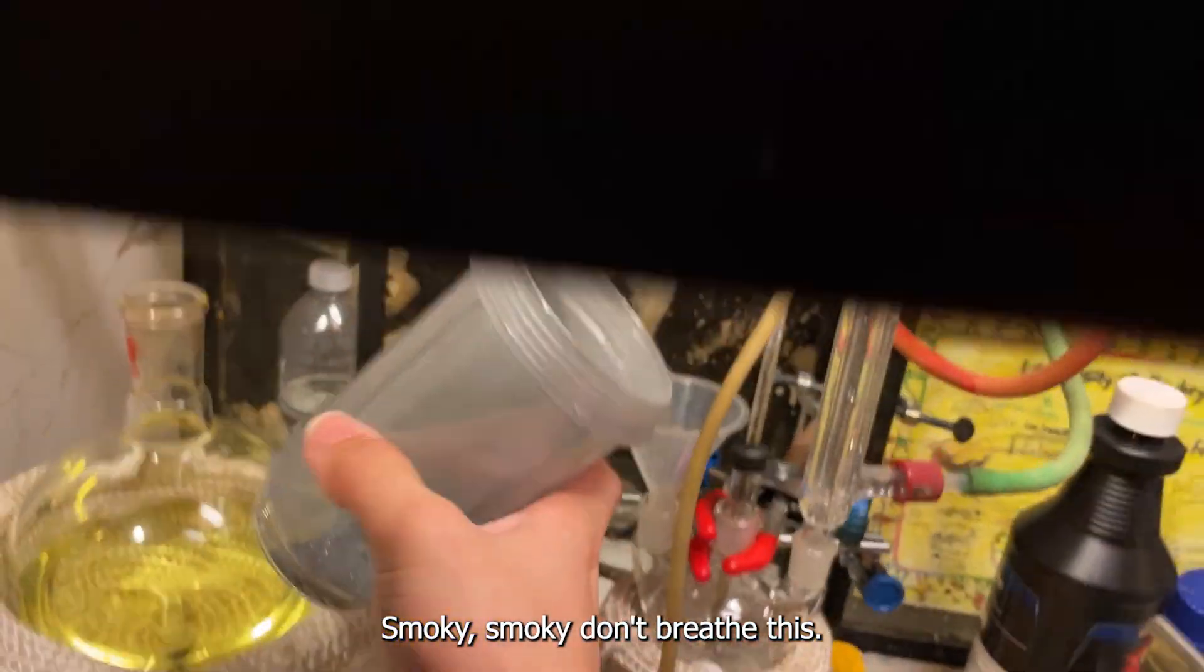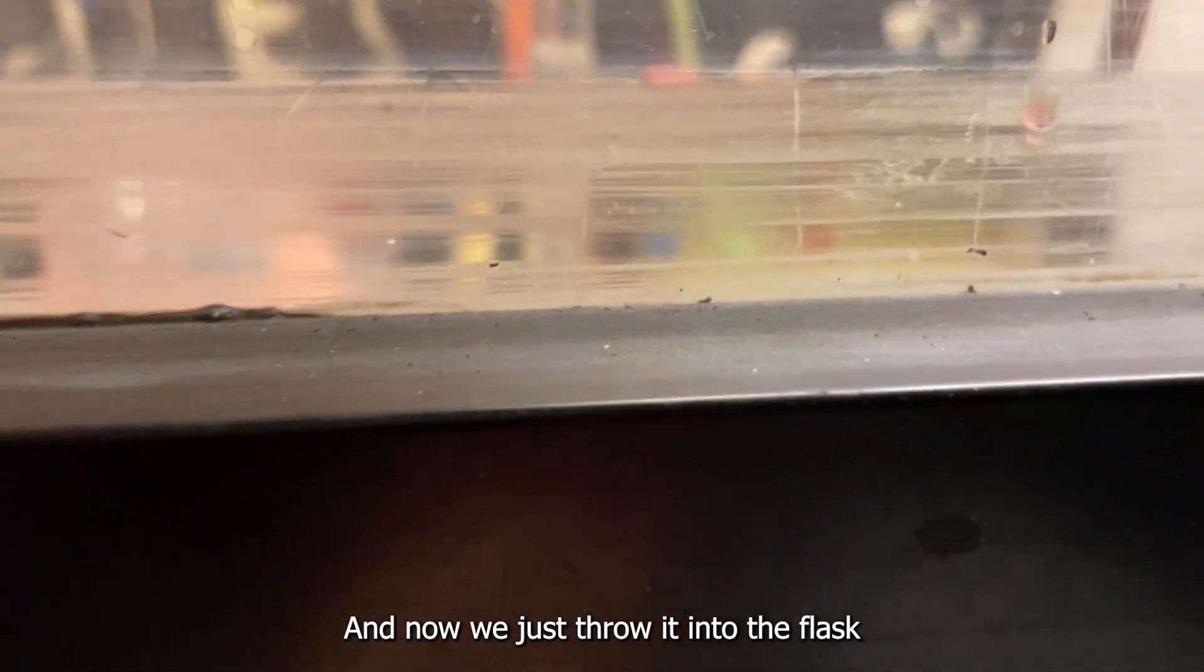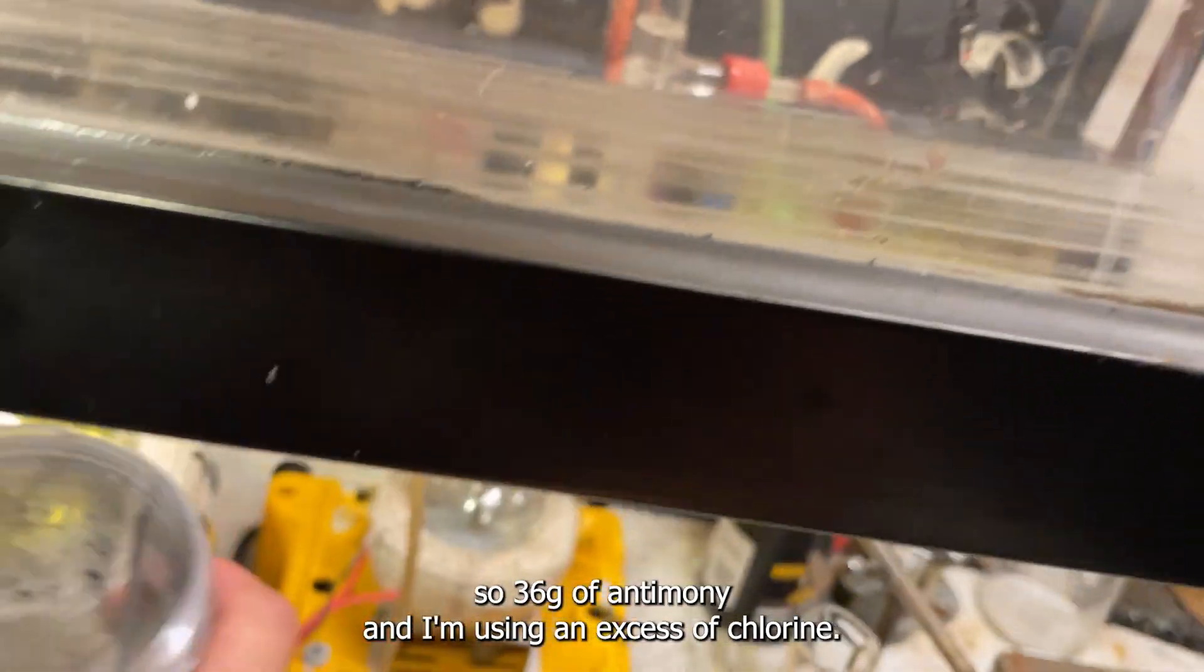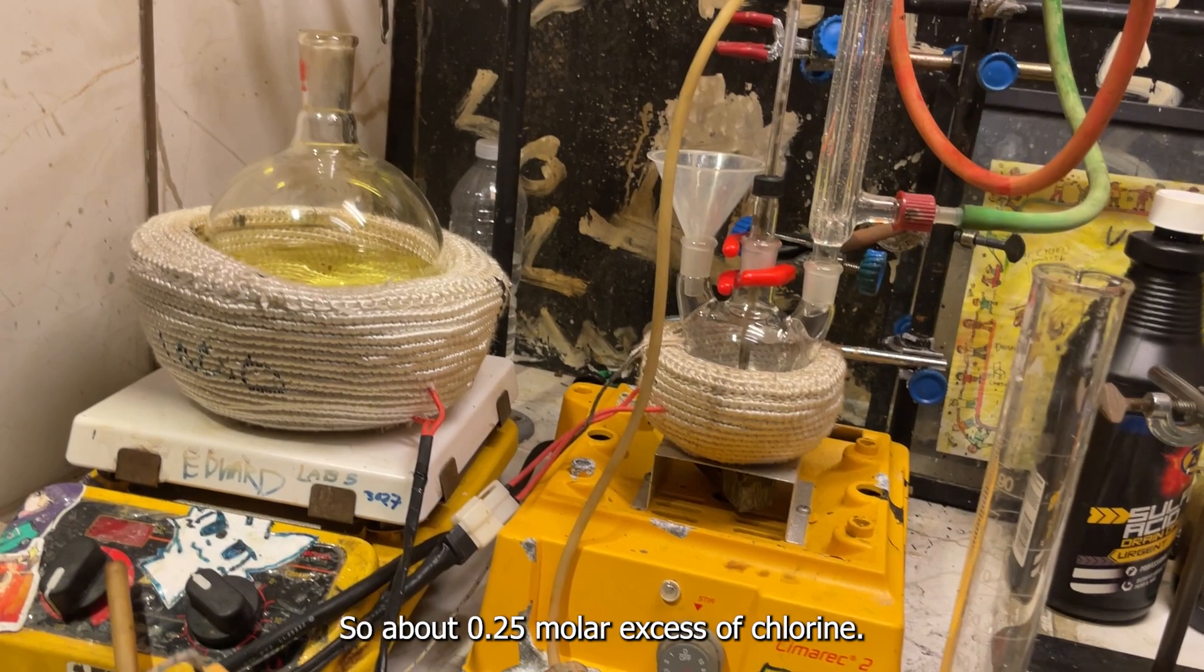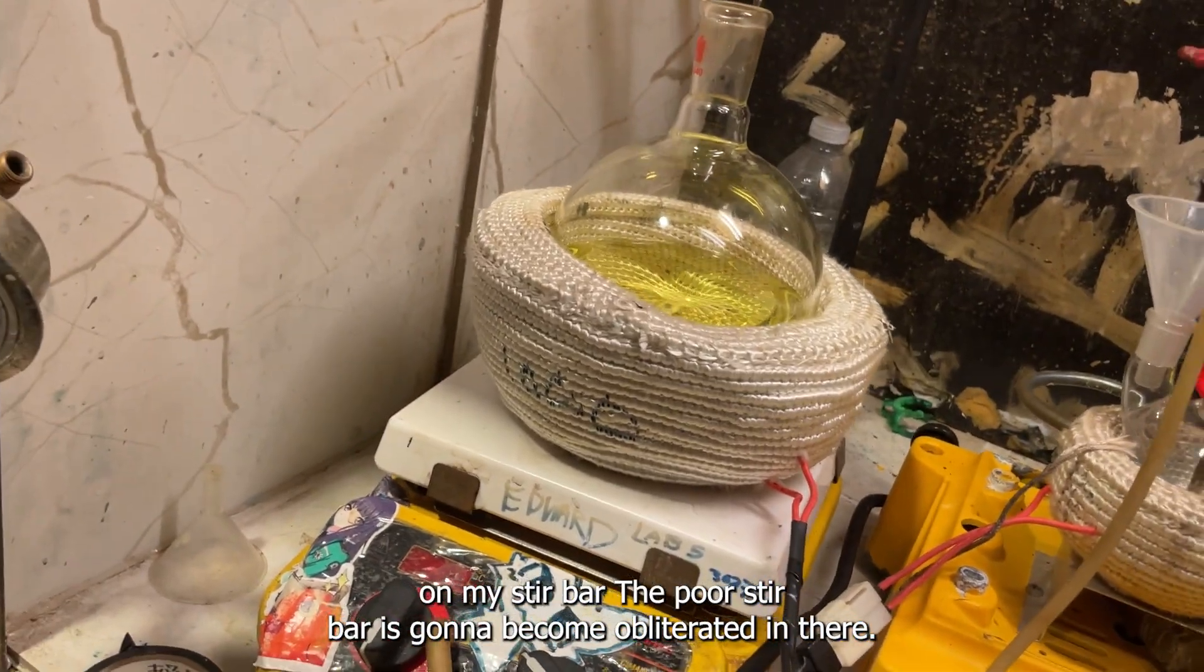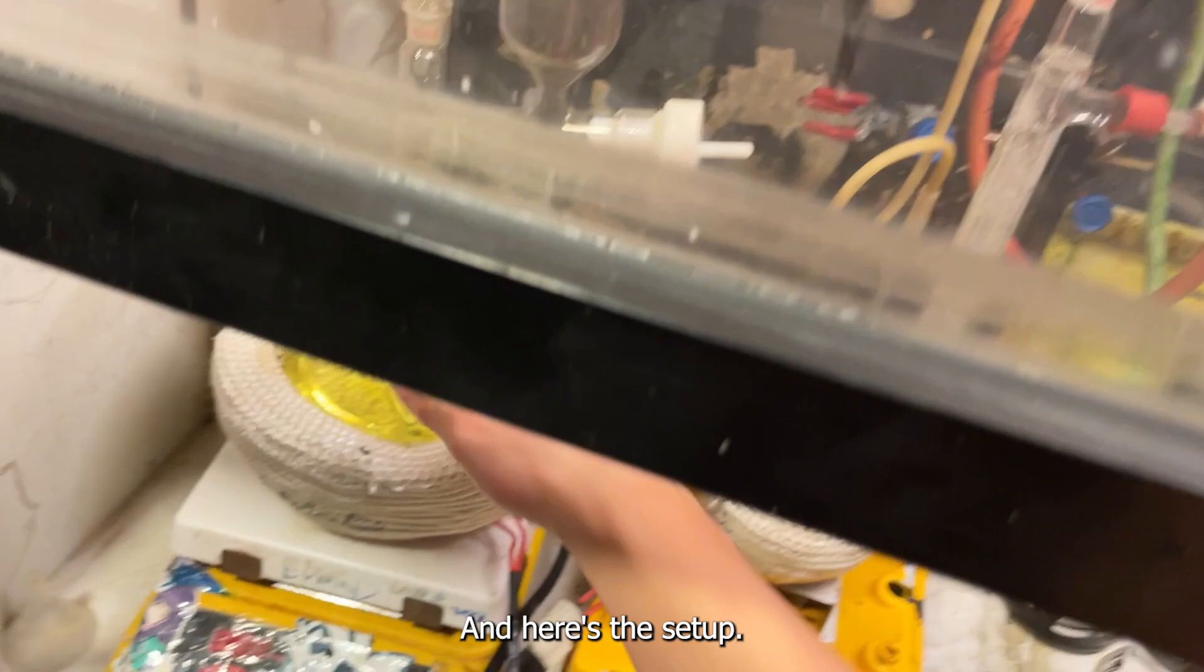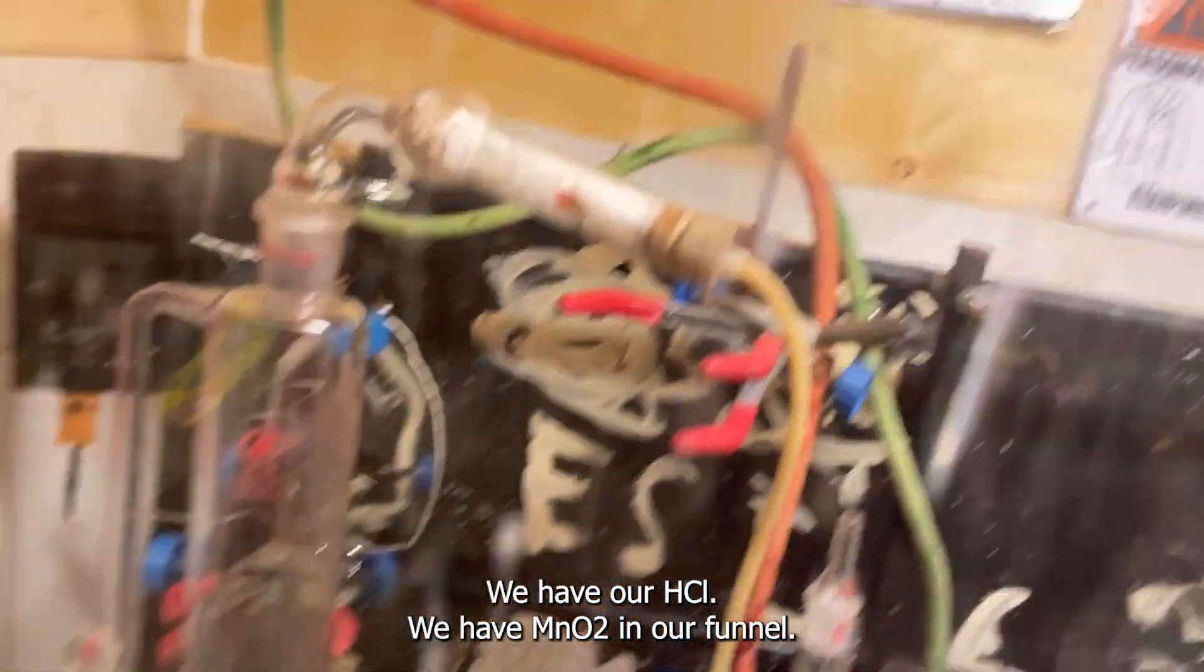Smokey smokey, don't breathe this. And now we just throw it into the flask. So 36 grams of antimony, and I'm using an excess of chlorine. So about 0.25 molar excess of chlorine. And the hydrochloric acid's gone yellow because there's iron filings on my stir bar. The poor stir bar is going to become obliterated in there. And here's the setup. We have our HCl. We have the MnO2 in our funnel. We have the drying.